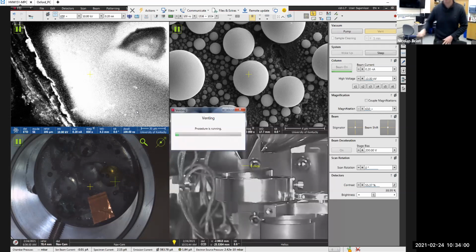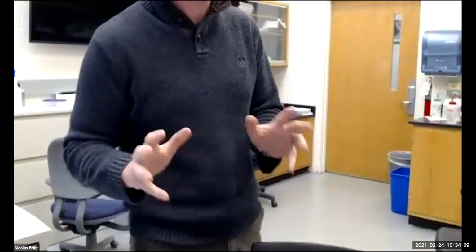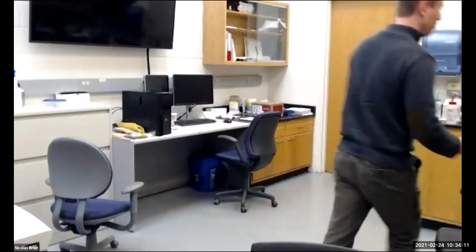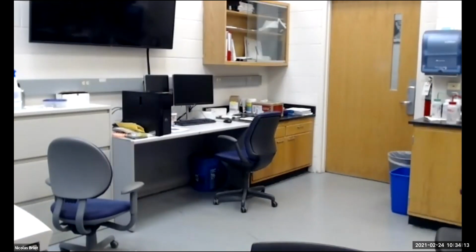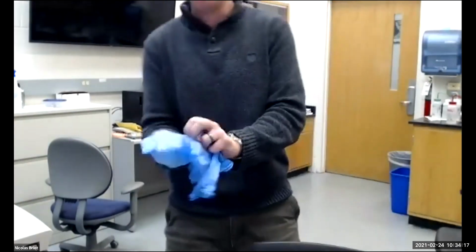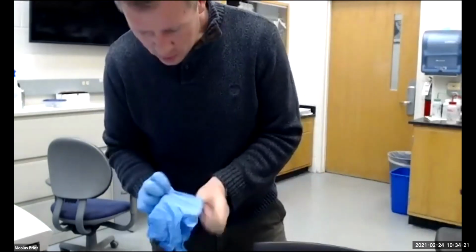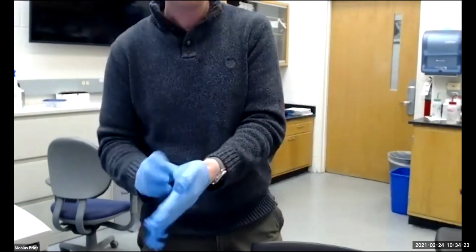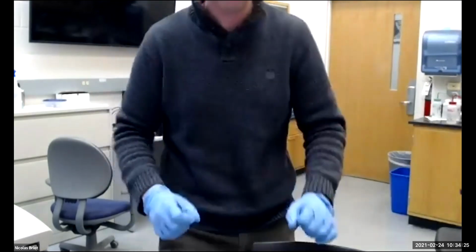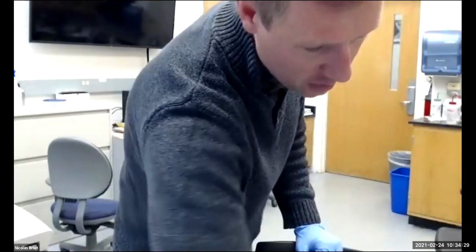But I can show you that. That's actually interesting to see. Let me stop that. Okay. So it's a vacuum system. I cannot touch anything that goes into the vacuum without wearing gloves. That would be bad. So we'll put gloves on. Always wear gloves. Without the gloves, you might not reach a good quality of vacuum, and you contaminate your machine and your sample. So you've got to be careful on those.